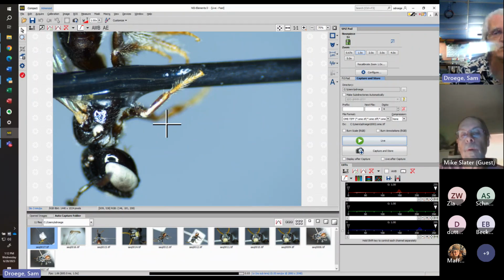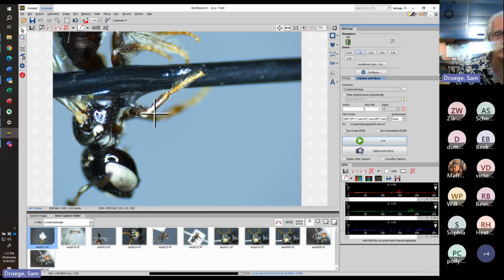And you'll see this same pattern, although this white stripe will be shorter, maybe to about there, maybe more like the third of the femur, the tibia on strenua. We'll show that definitely too. And then there'll be a white mark here. And in floridana, which we'll also look at, there is a stripe, but no white mark.